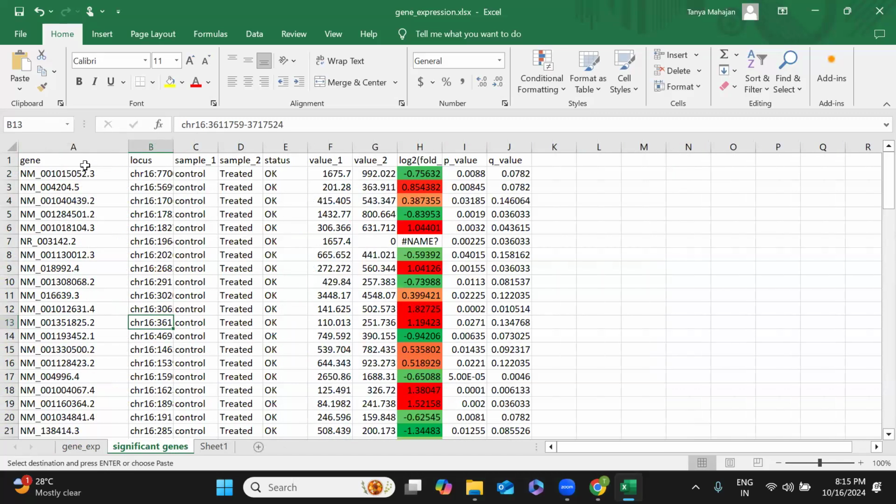Now, can you tell me how many significant genes did you get?